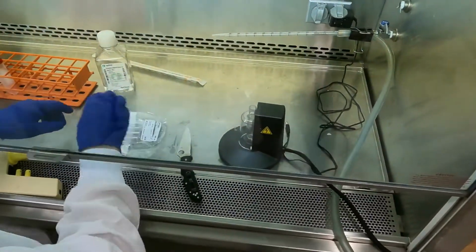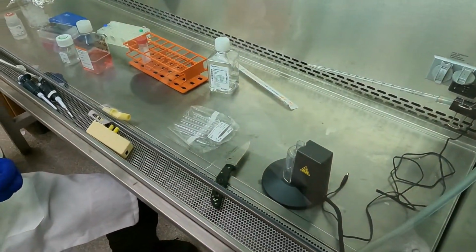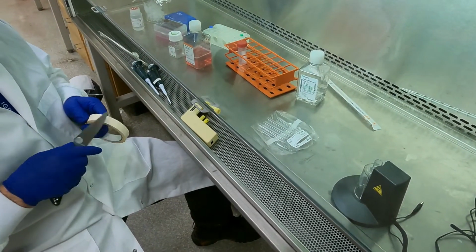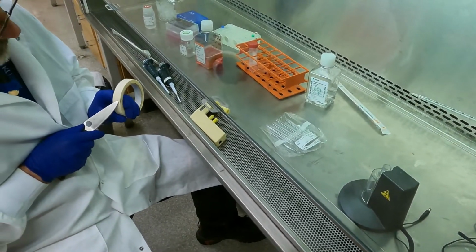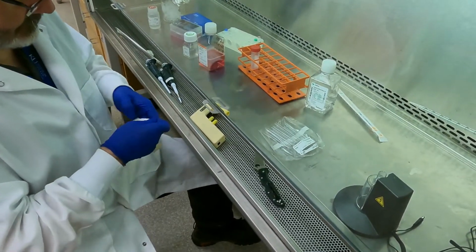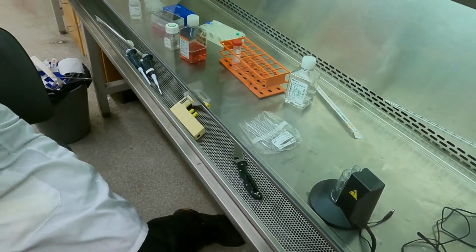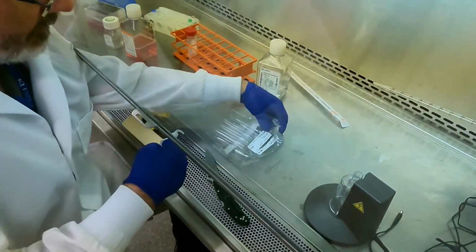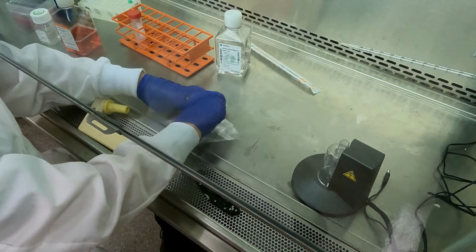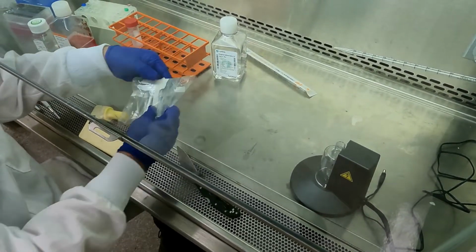And I'll leave that like that, and then you've got to seal your bag. I just use autoclave tape. Maybe I should have had the autoclave tape ready. Let's see there, to get it started here. And we'll just seal the bag. Seal it. Handle it over. Seal it. Put it away somewhere safe.